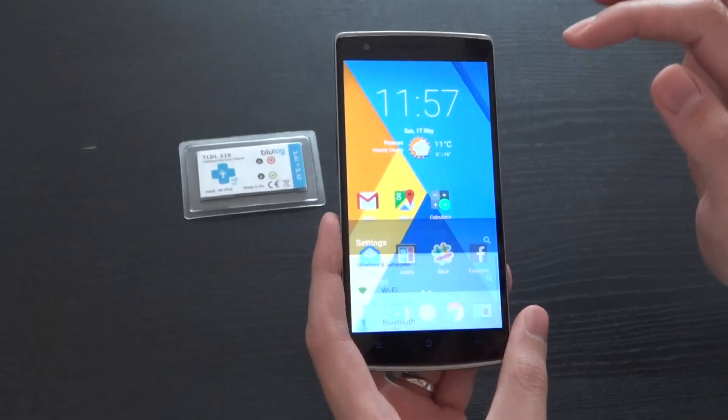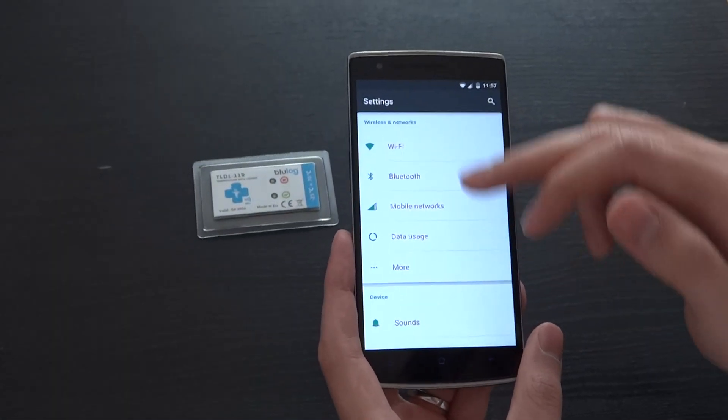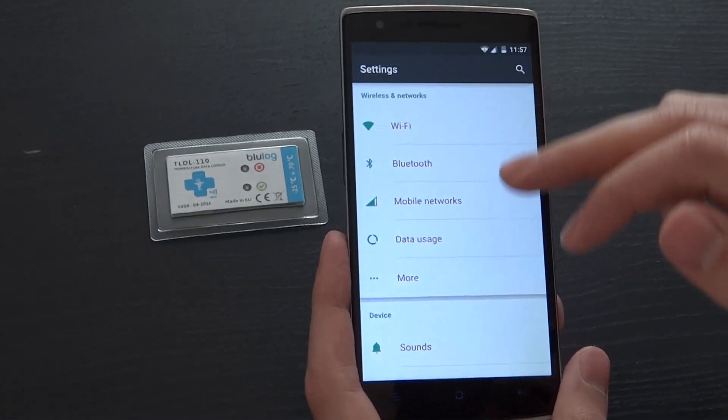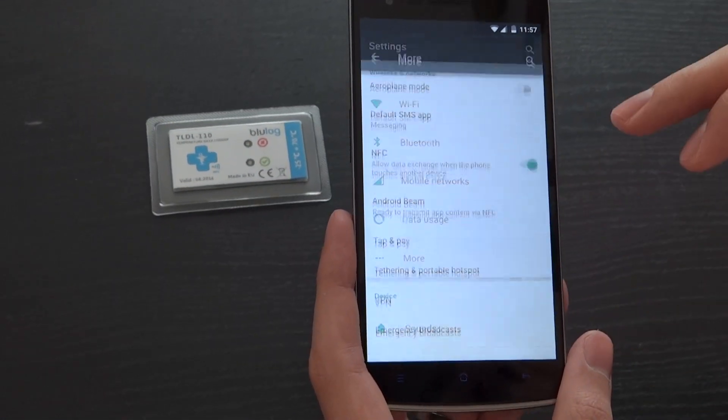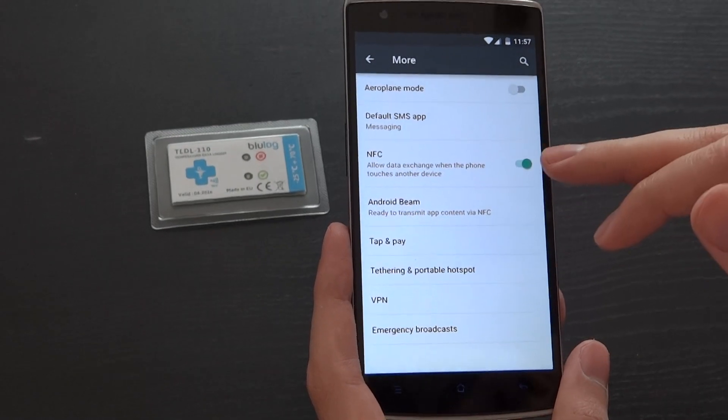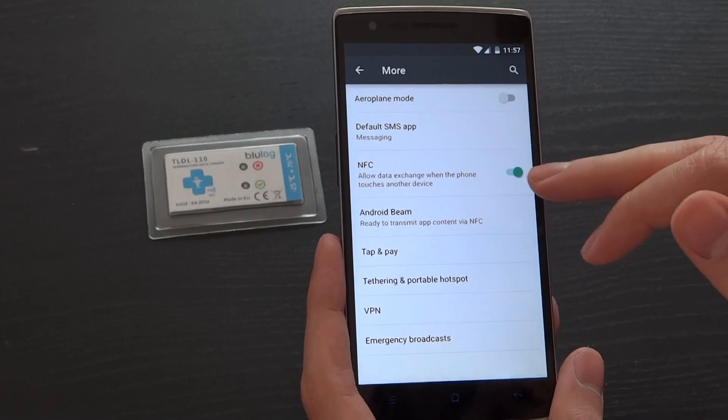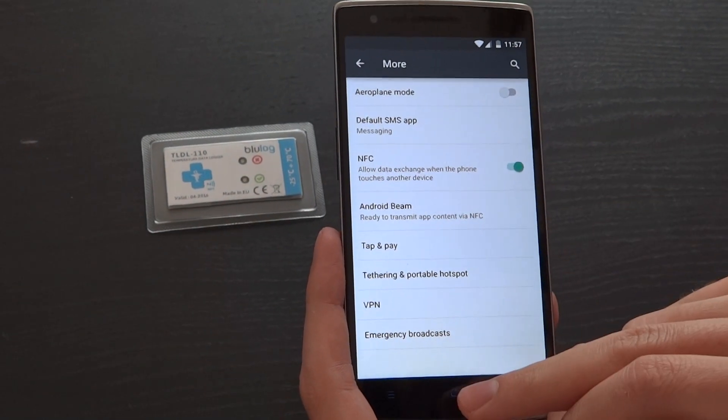To do this, simply go in the settings, wireless and networks, and more. You can see that NFC is activated.